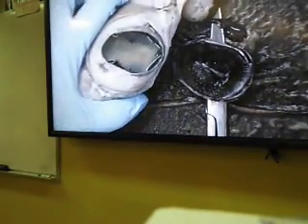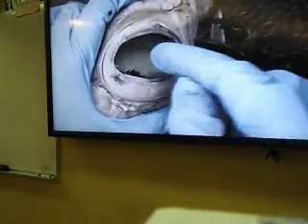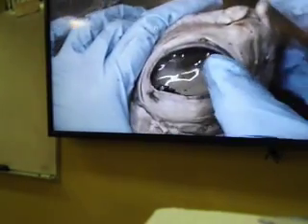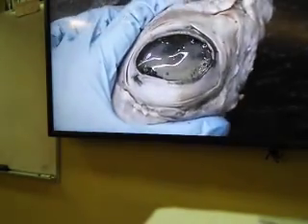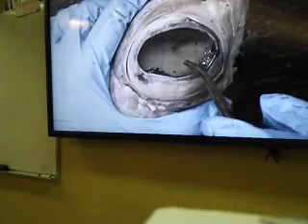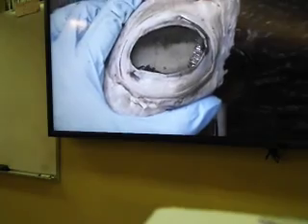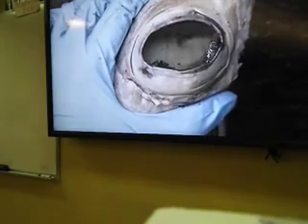Also vascular tunic. Now to see the choroid, which is on the posterior cavity, I have to take this liquid off. And this liquid, unlike this one which is watery aqueous humor, is jello-like, and this we call vitreous humor. And vitreous humor keeps the shape of the eyeball, but another thing you see it doing is pushing this beige color structure that you see directly underneath the vitreous humor against the back of the eyeball.